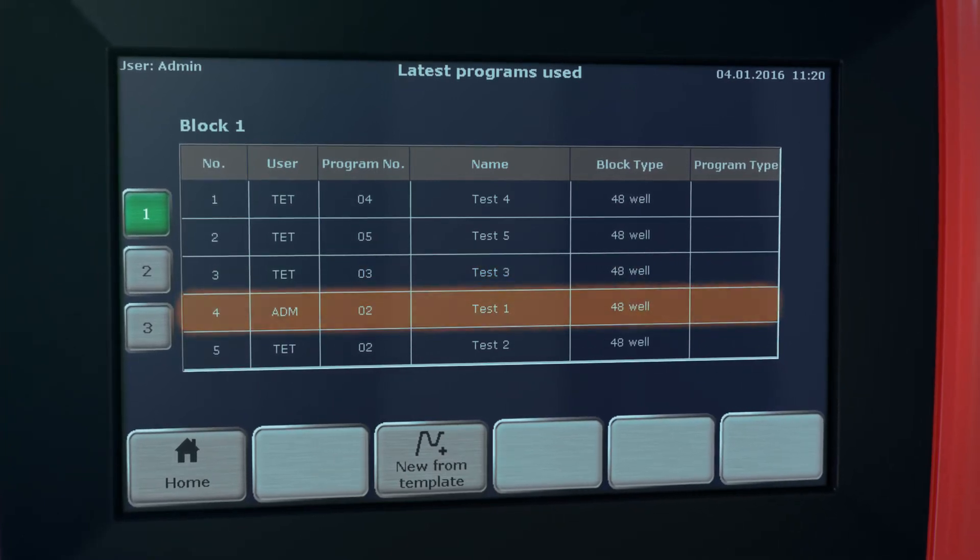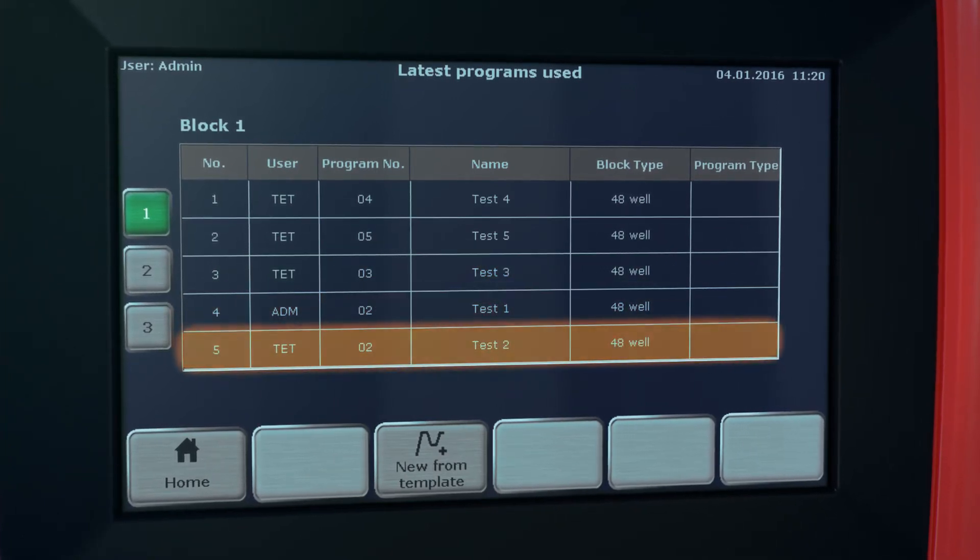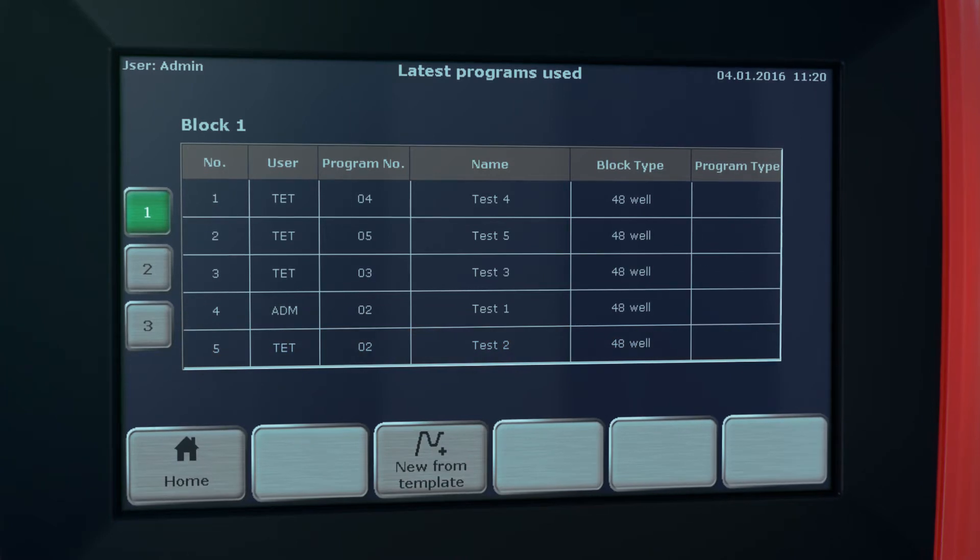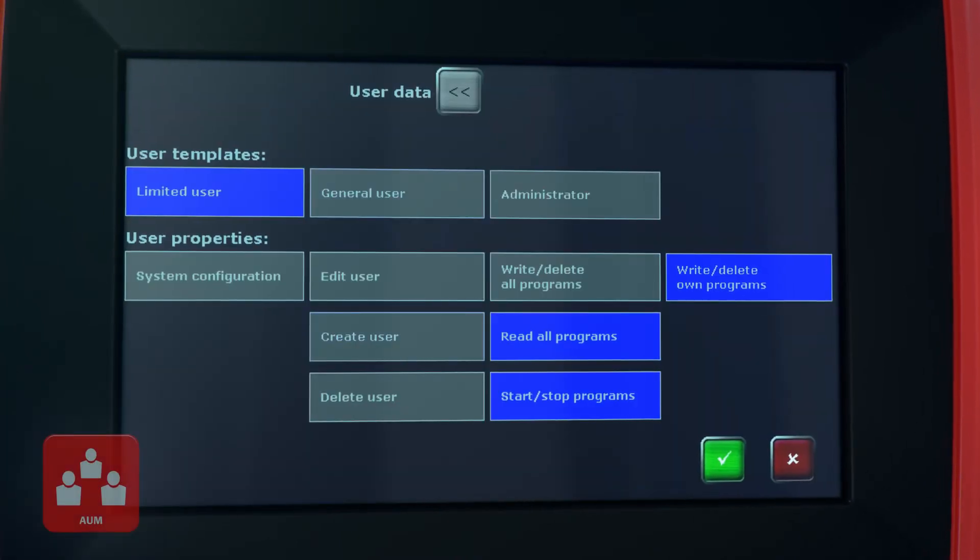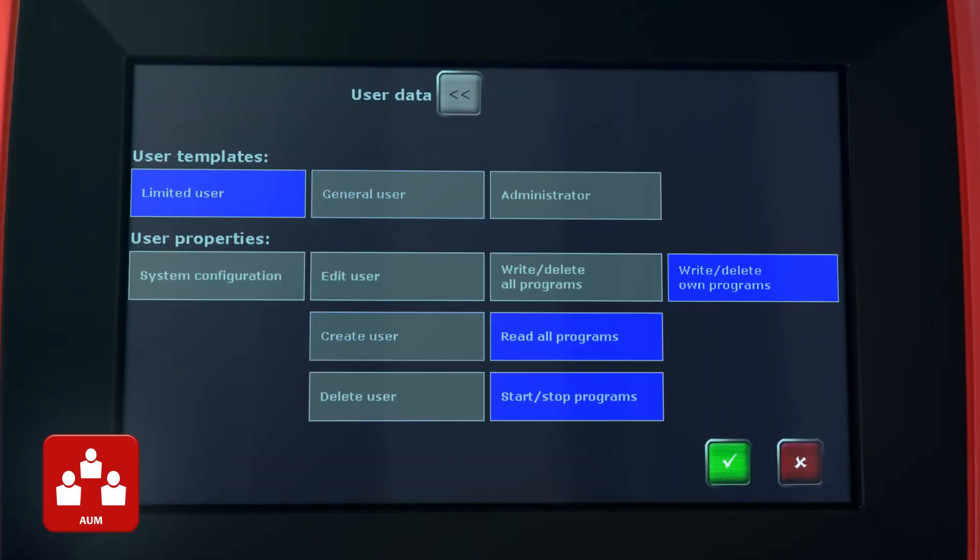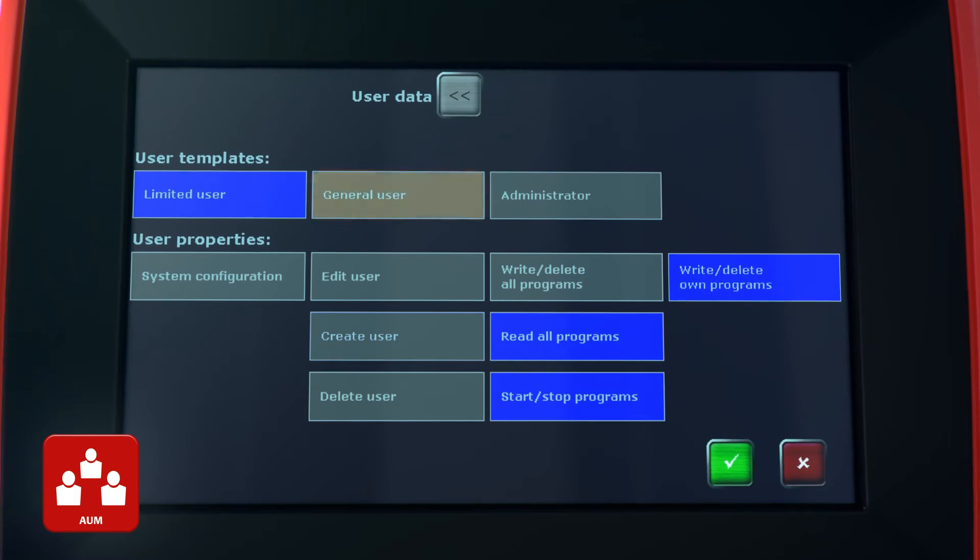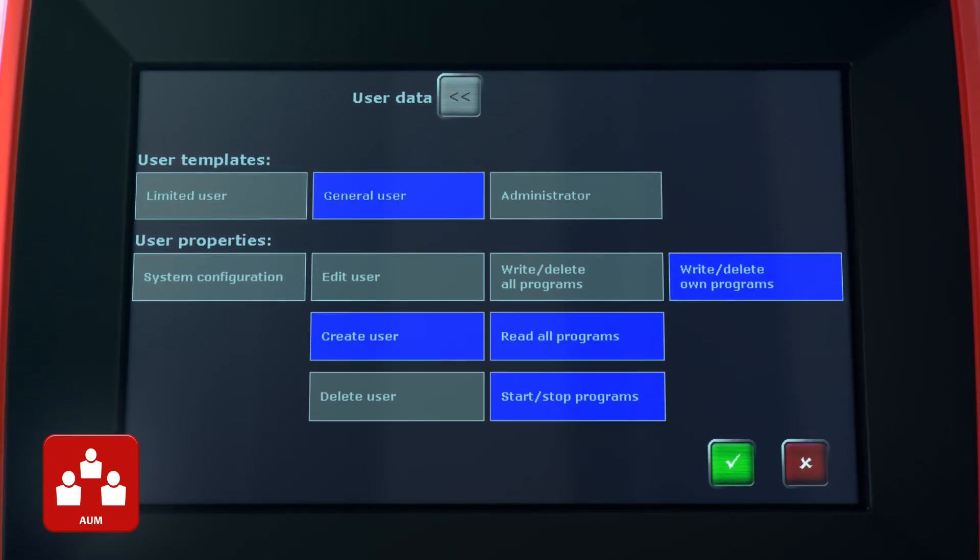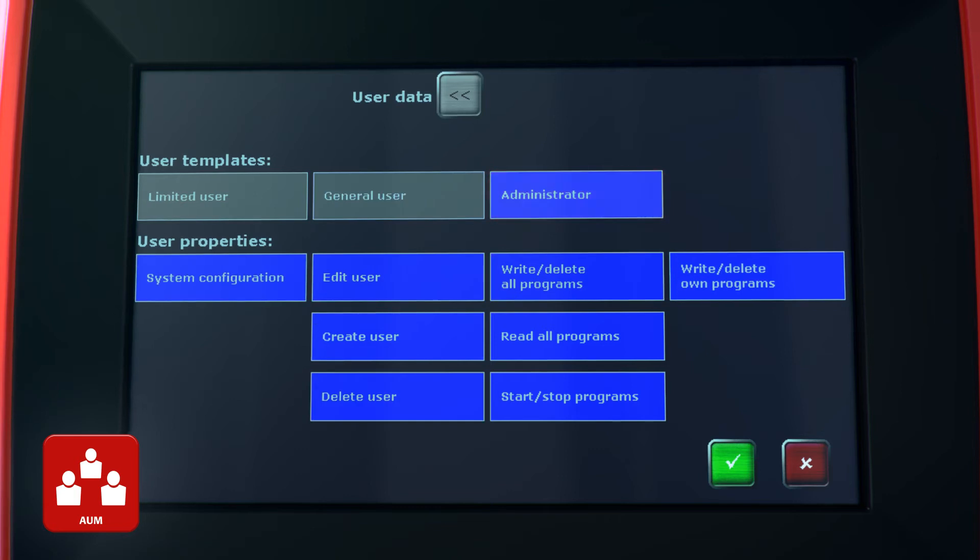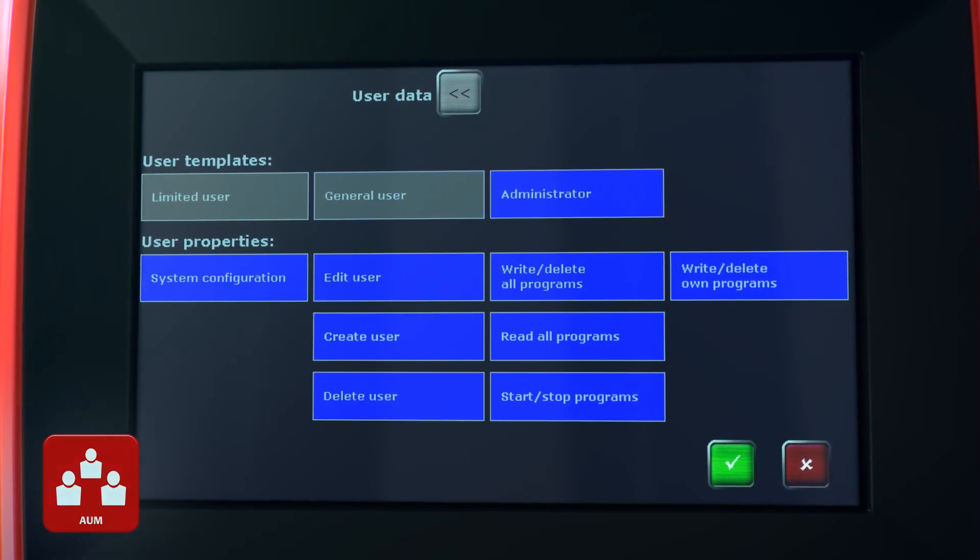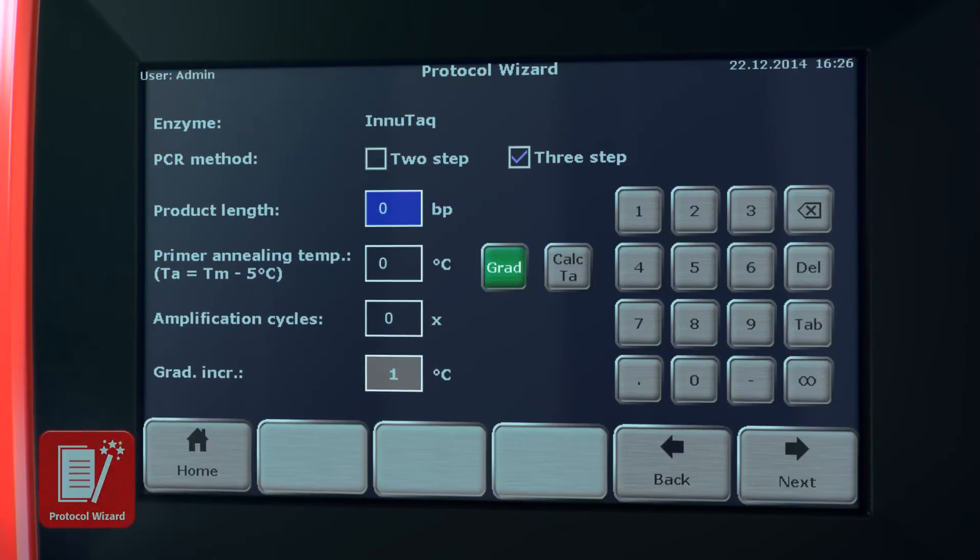For system administration, the advanced user management tool is used. Three different user levels with different default rights settings are available. The rights settings can be modified for each single user individually.